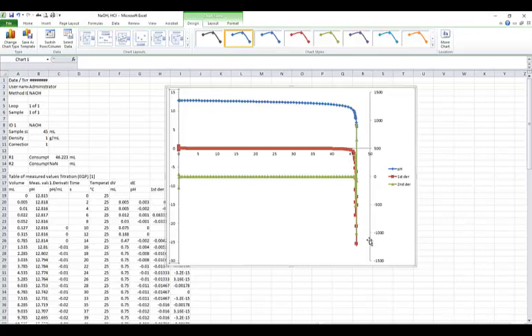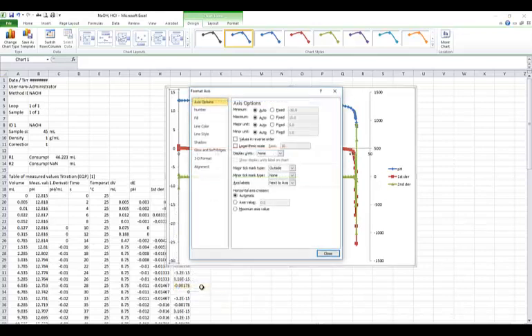We'll lose a couple of points on our first derivative, but I don't think we'll really lose much understanding of what's going on, because we'll have the line showing where those points would be if you kept following it. So I'm just going to change this axis. So again, select the axis, right click on it. That works for many things in Excel if you want to format them, and I want the minimum to be minus 15.